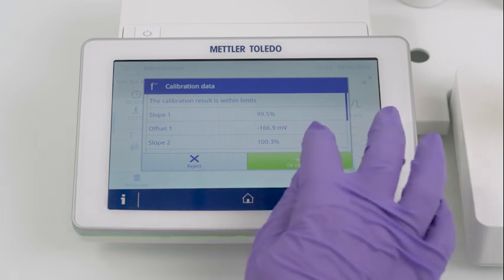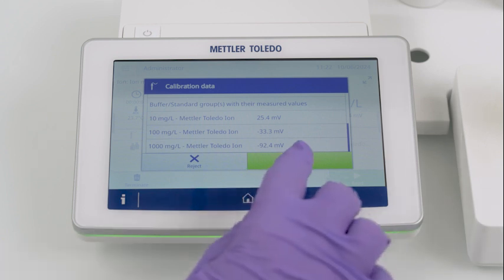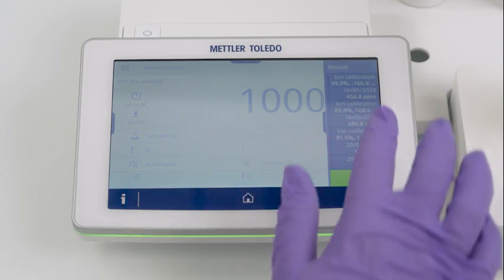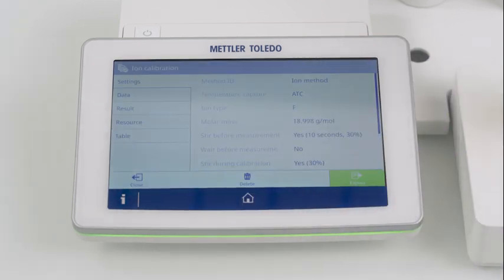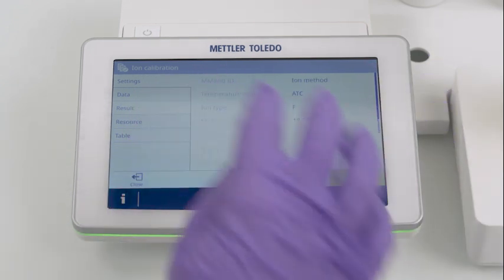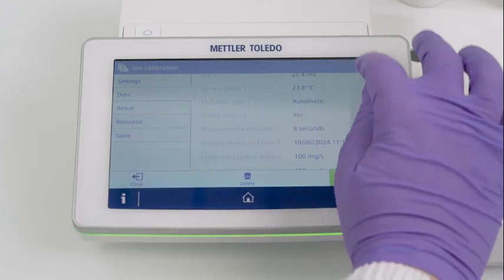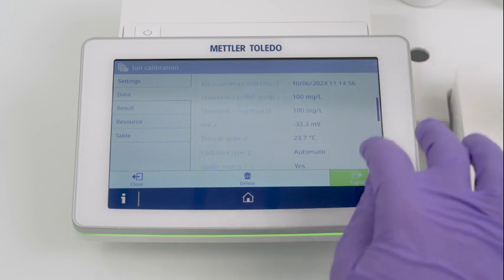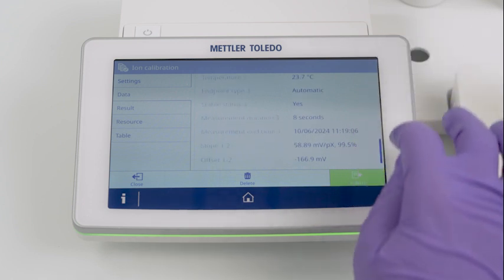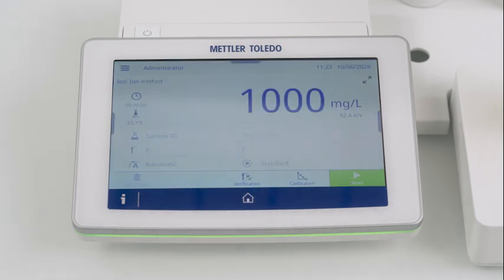Once you've measured all calibration standards, check the calibration data. And there you are — the perfect ion electrode is now ready to measure.